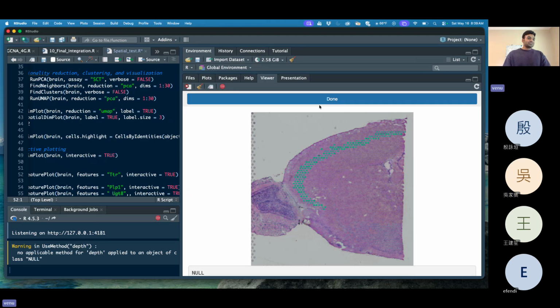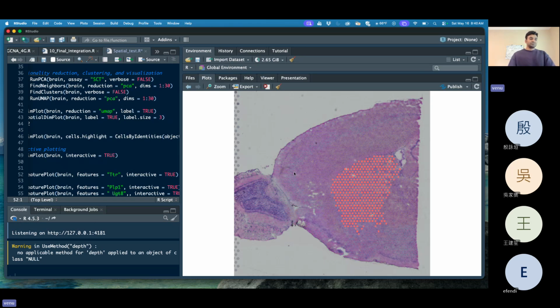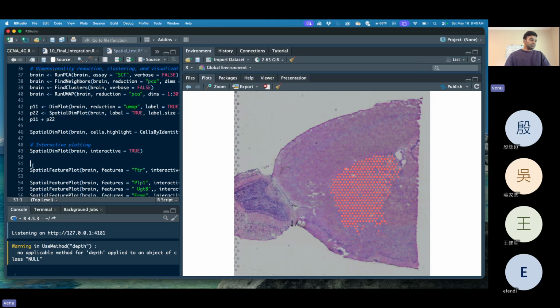Okay. So if I need to find a particular spot, all of these are associated with similar expressions. This is, we can say, one region. Within one region, each spot has top cells with expressions, and a second layer is always involved. If I want to study this region, I just select this one. This is the tissue and this is the spot level. Let's dive into another.